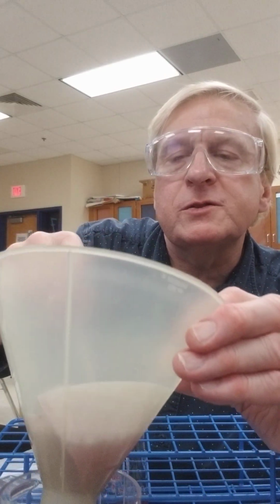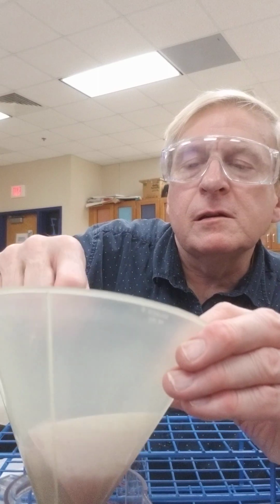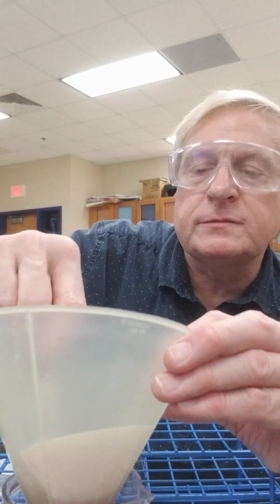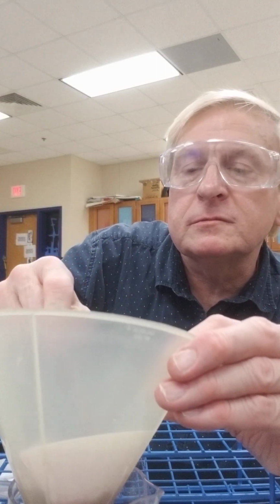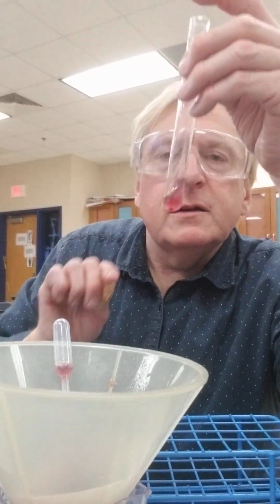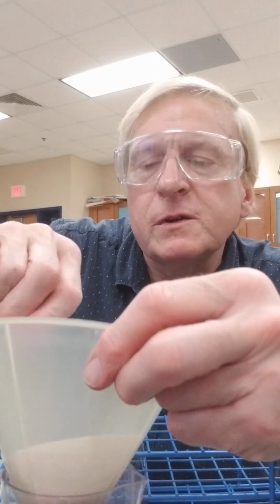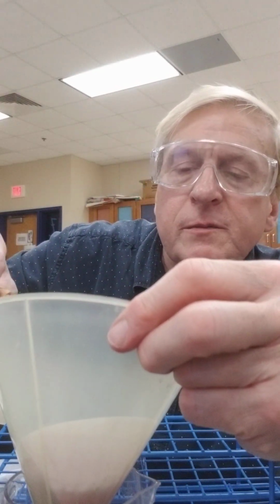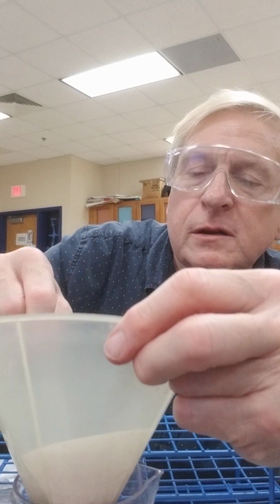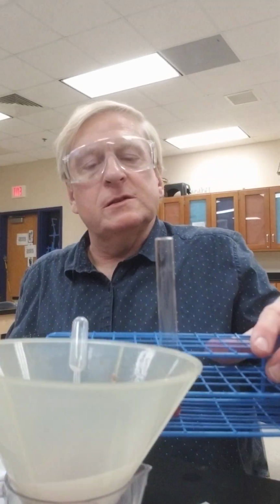Sometimes with the stirring rod you can pull big strings of it out. I'm getting smaller blobs of it out, but that's definitely the DNA. I have the DNA in this liquid here. You can pull it out and you can study the DNA. Sometimes, like I say, you can take a stirring rod and string it out. This one I used the pipette, and I'm pulling some of it out a little bit at a time, separating it from the fluid, pulling that DNA out, putting it in this container, in this test tube.